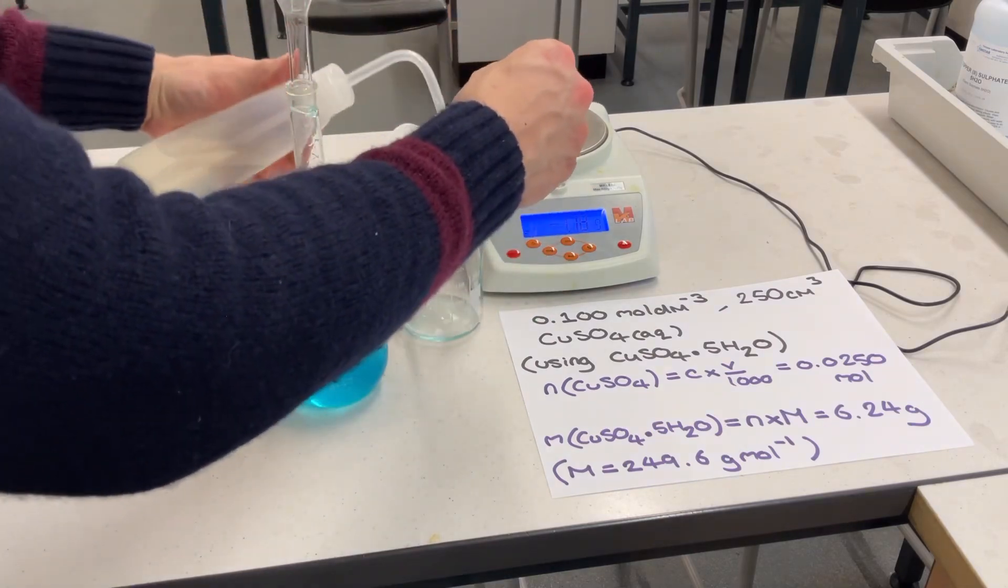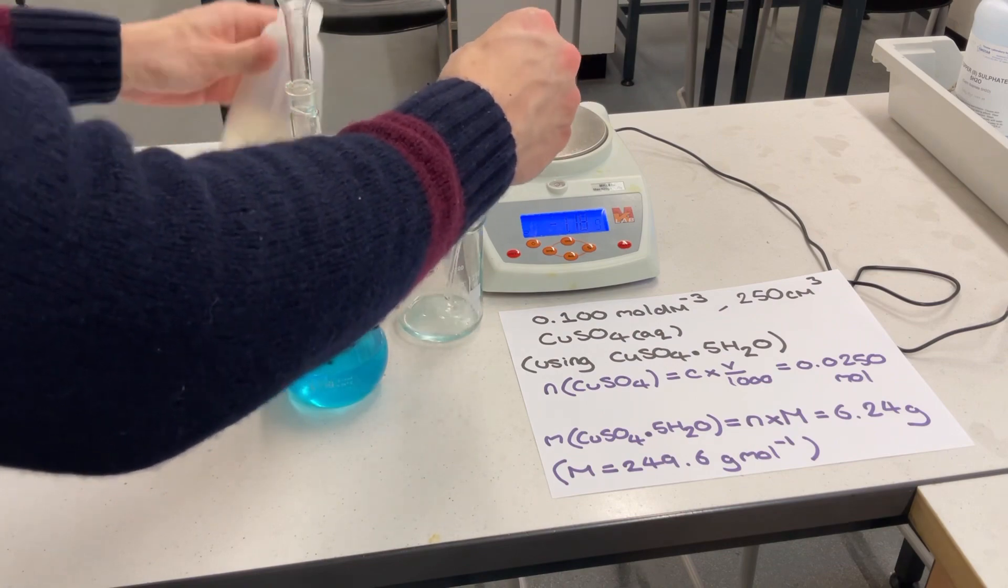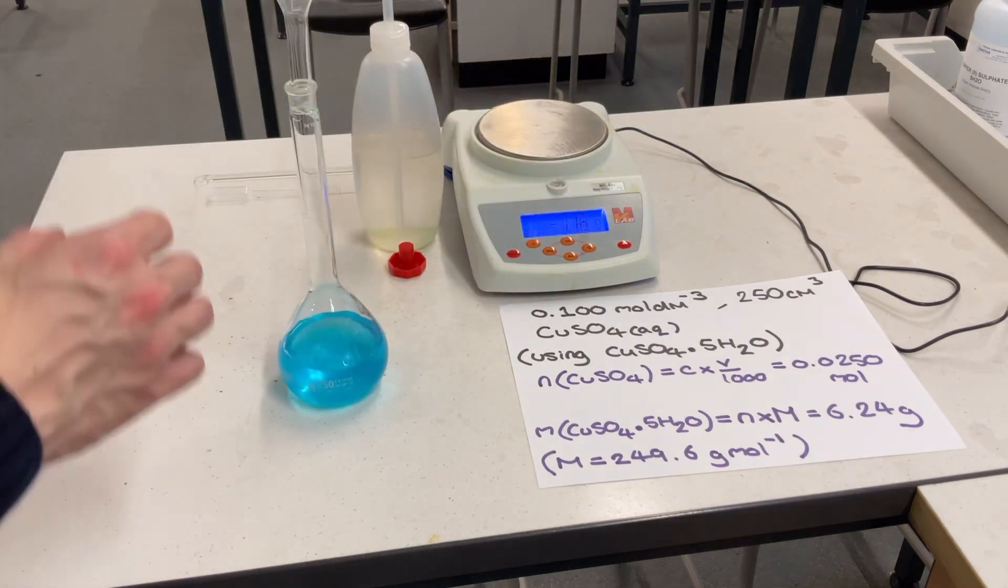Step 4: Before adding any more deionized or distilled water to the volumetric flask, I need to make sure I transfer any washings from the beaker into the volumetric flask solution.